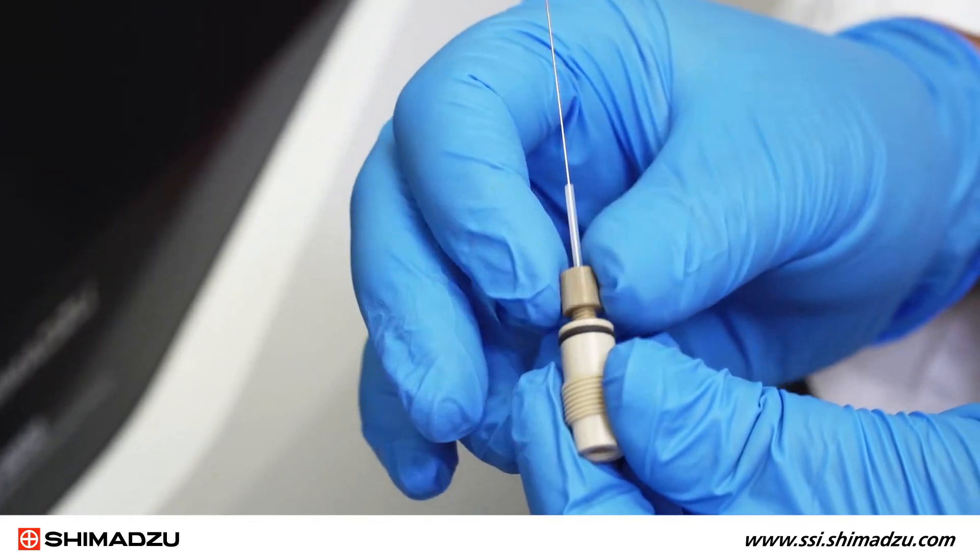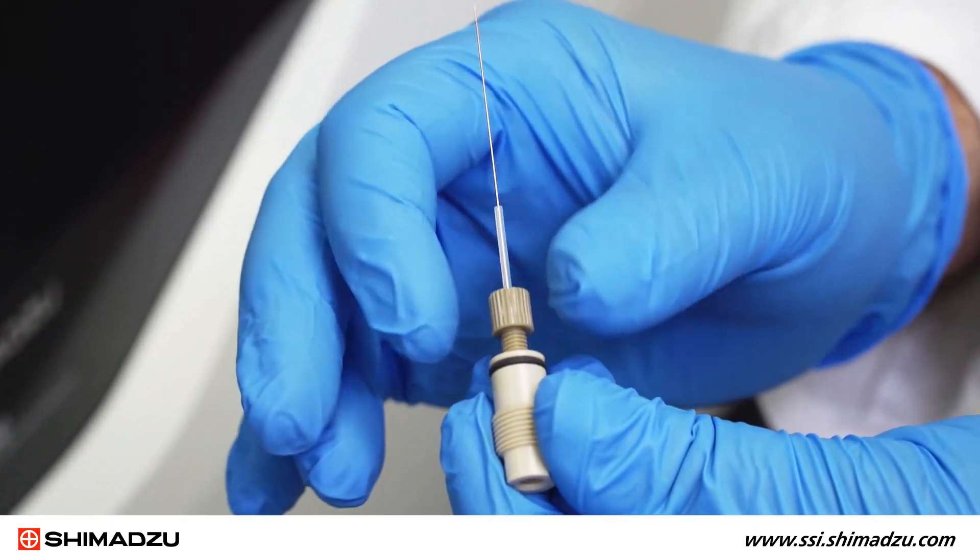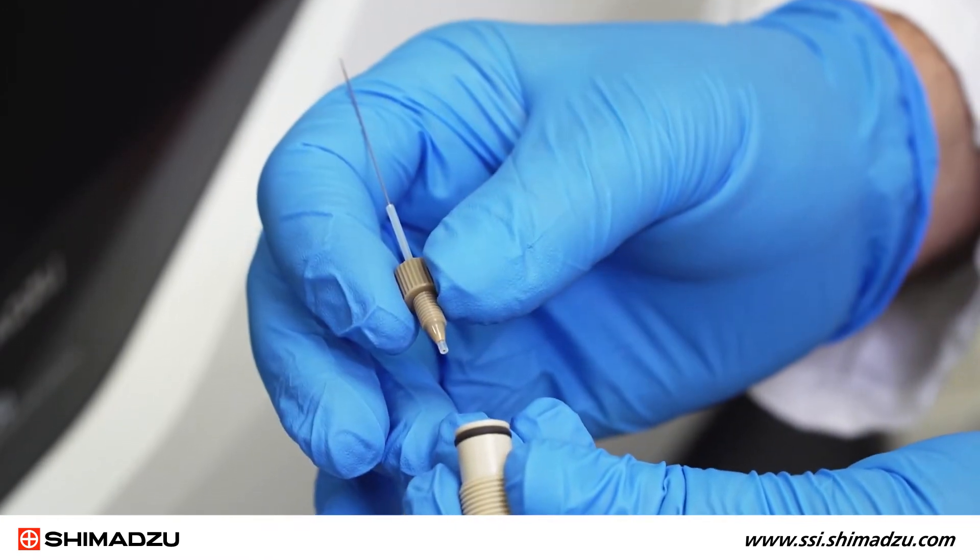You can use your fingers for this, or if the coupling is too tight, you can use the 8 mm wrench as demonstrated in the instruction manual.